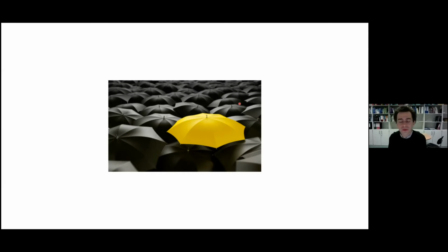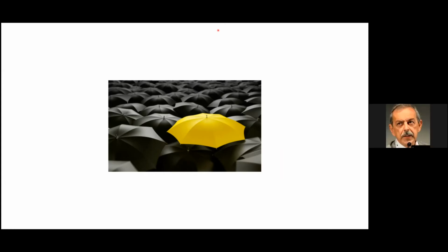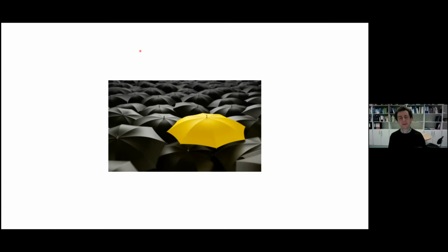So one way, of course, there is an answer. I cannot see the chat, but now I can. Francesco Formaggio says endogenous signals. Yeah, right. But your question now is that you have all molecules emitting in the same way, which basically all look the same. It's like you look at a square of people who all wear the same hat. Let's say a green hat.